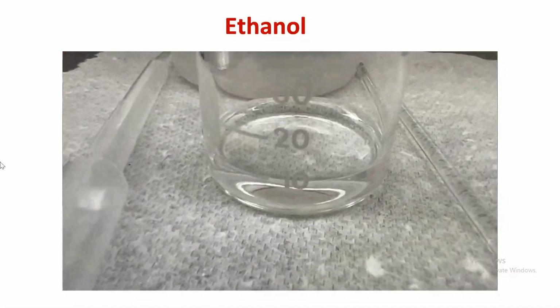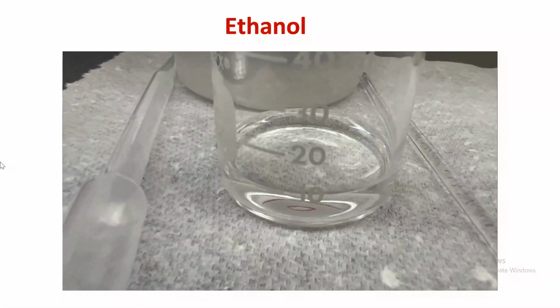So can we figure out any density observation? So we're going to write no layering for table 2. We don't see any other layers, so the conclusion would be NA, not applicable. When we stir it, again, we don't see any layers, not applicable, and finish the 3 tables. Now you can pause the video, record all your observations for table 1, 2, and 3, and now let's go on to the second liquid.